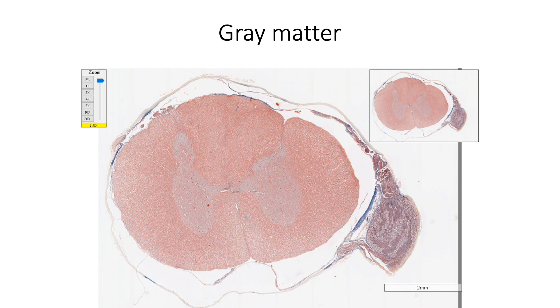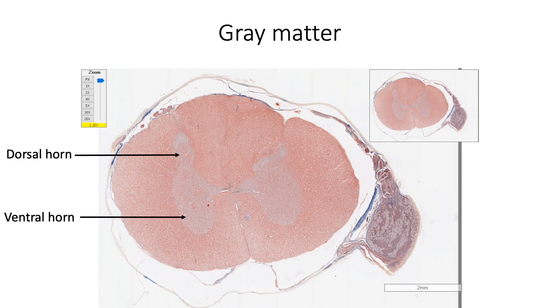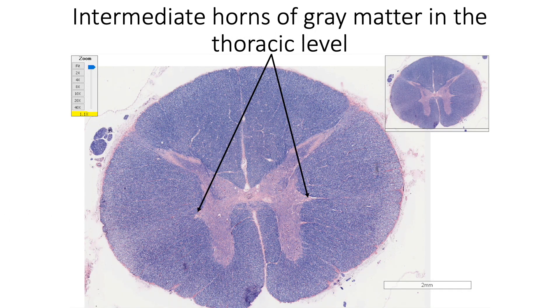On either side, the grey matter shows a ventral horn and a dorsal horn. While the white matter separates the ventral horn from the surface, the dorsal horn extends to the surface showing four distinct parts: apex, head, neck, and base. In the thoracic segments, an additional intermediate horn of grey matter can also be seen on both sides, where preganglionic sympathetic neurons are located.